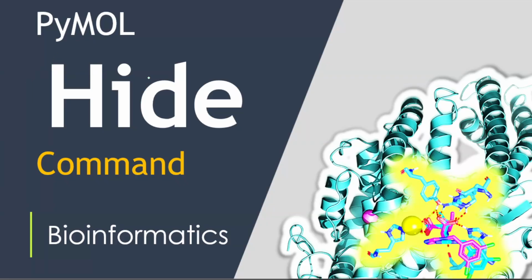In this video, we will be understanding about the hide command in PyMOL, how we make use of the hide command to do structural alterations and represent different structures, right? So without any delay, let's start by understanding the hide command. We'll start with slide number 1 right over here.